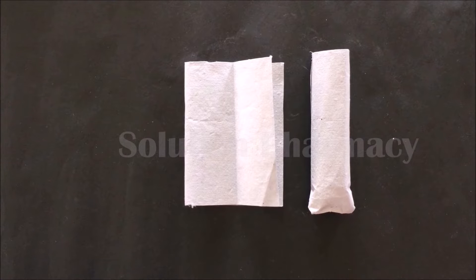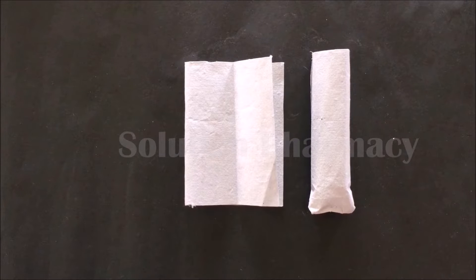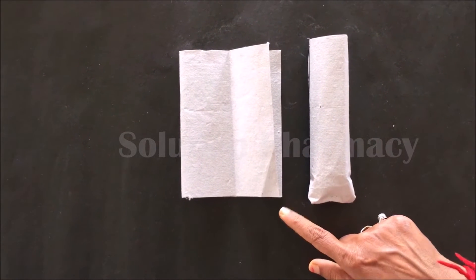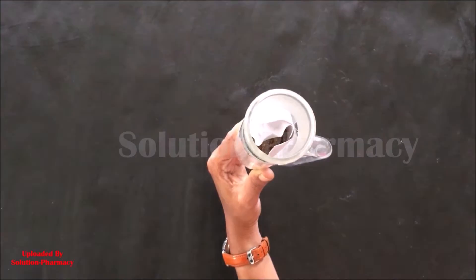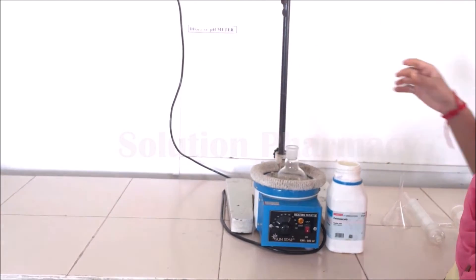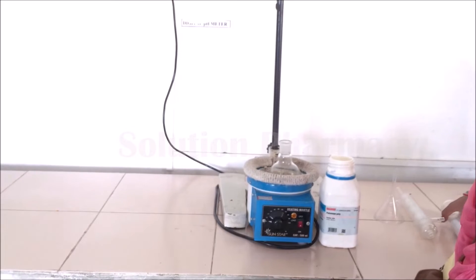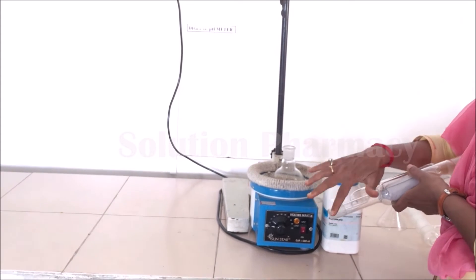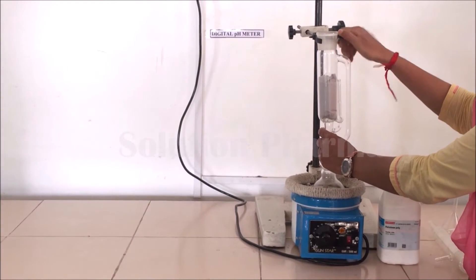For the extraction, first we have to prepare a thimble by using filter paper, muslin cloth, or ready-made thimbles available in the market made of cellulose. Here we have prepared the thimble using filter paper, and then transfer coarsely powdered crude drug into the thimble. After this, transfer it into the Soxhlet extractor, then keep the round-bottom flask in the heating mantle and add glass beads to avoid bumping — bumping means to prevent the solvent reverting back from the round-bottom flask to the Soxhlet extractor.